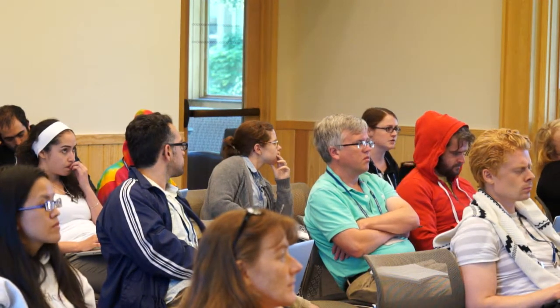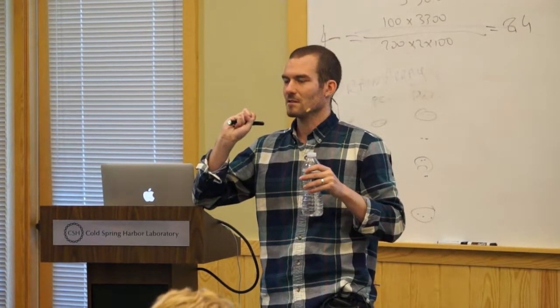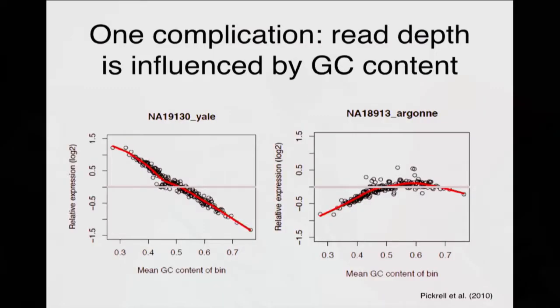I see. That's interesting, I didn't know that. There are recent things I've seen in genome sequencing as well, maybe the same sort of thing, where people do genome sequencing with quote-unquote PCR-free libraries, even though there are some PCR steps, but it gets rid of a lot of it. I don't know what the kit was.